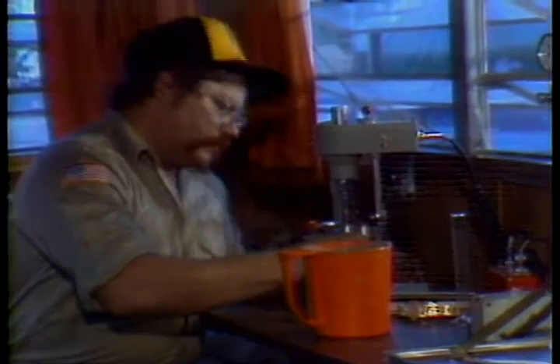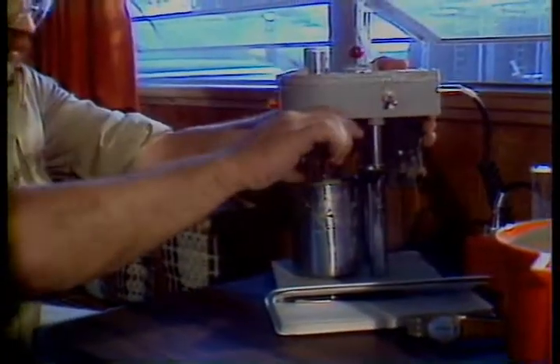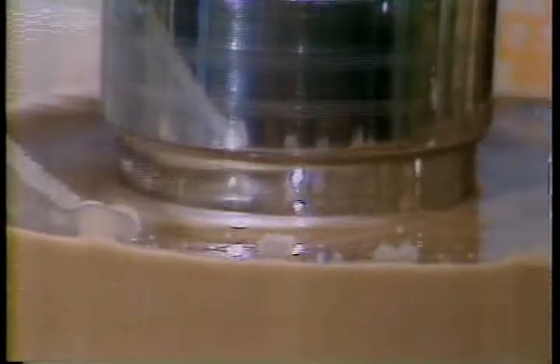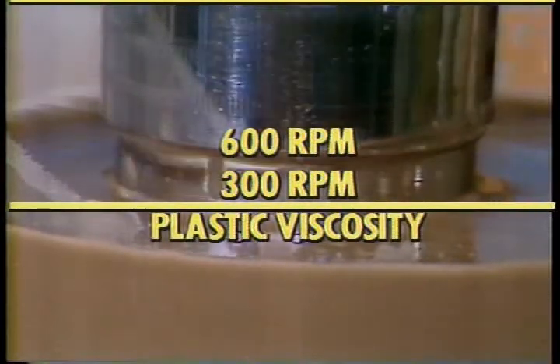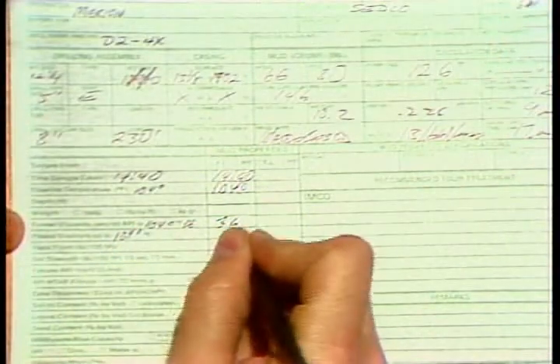But the inner one is trying to hold the liquid still. So, by reading the scale attached to the inner cylinder, we can tell how much resistance the liquid has to the motion of the outside cylinder. The cylinder is turned at 600 RPM, then at 300 RPM. The 300 RPM reading is subtracted from the 600 RPM reading to get the plastic viscosity, which is recorded in centipoise. Readings are entered into the drilling mud report.